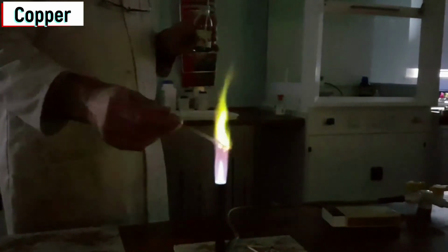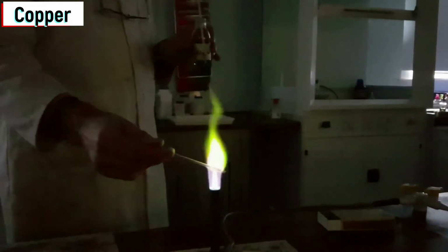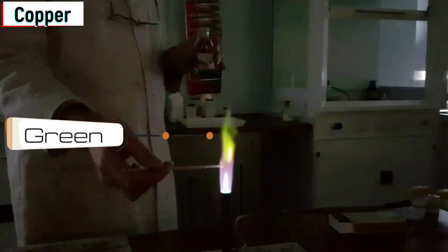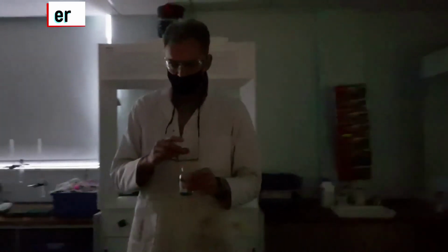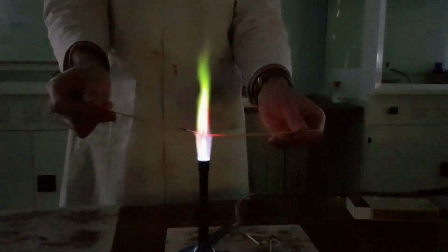The final one you do need to know is copper, very distinctive. A lovely bright green flame here that you cannot mistake. And perhaps, since it's just after Christmas, shall we do copper and strontium together? The lovely red and green of Christmas. Thank you very much, Mr. Reeves.